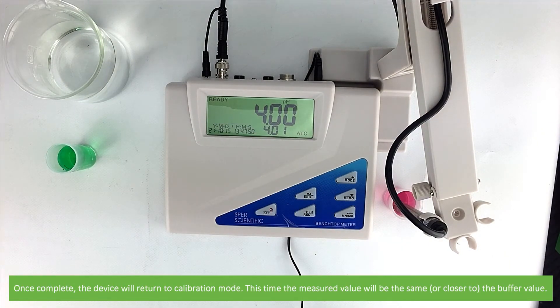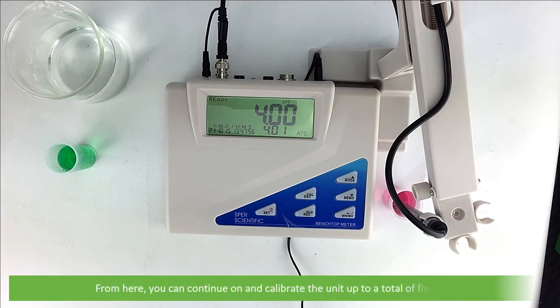This time, the measured value will be the same as the buffer value. From here, you can continue on and calibrate the unit up to a total of 5 points.